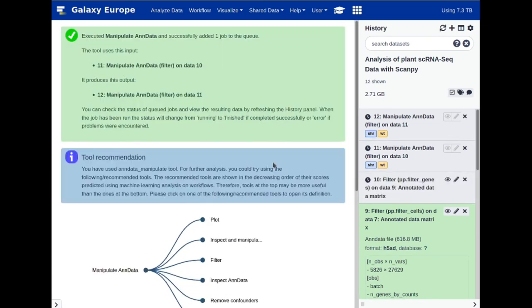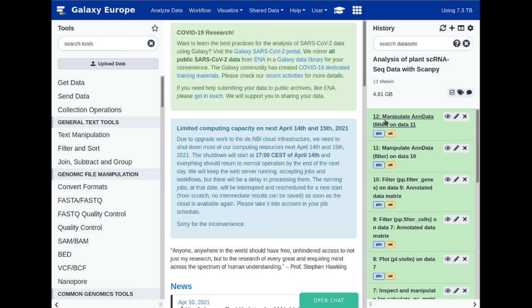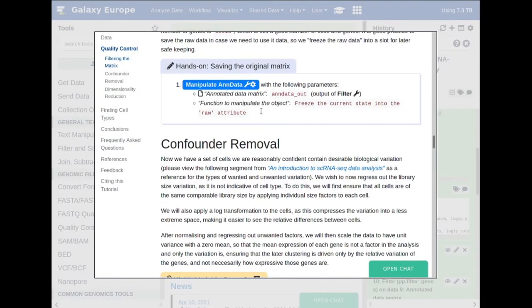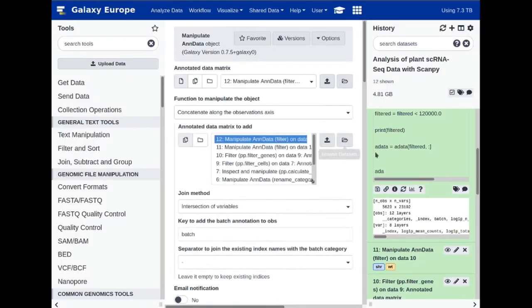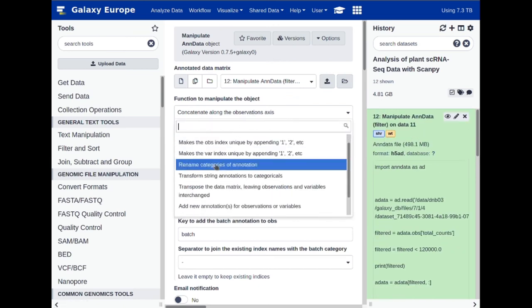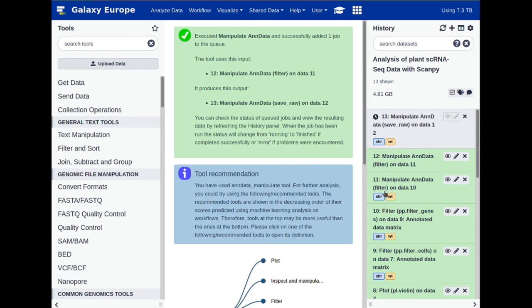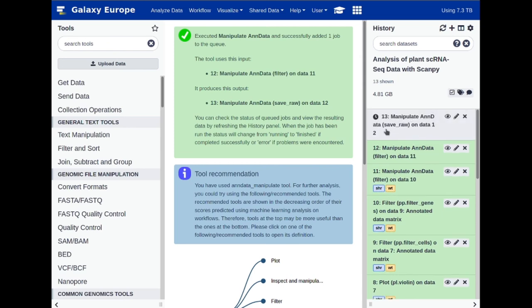Execute that. If we take a look at this dataset, we see we have 5,623 observations and 23,102 variables, which is exactly what we expect to see. What we now want to do is preserve the original matrix by freezing it into a raw slot. This will help later on — potentially not in this analysis but in a later analysis where you want to perform rank gene assignment and wish to use the original dataset. Click on 'Freeze the current state into the raw attribute' and execute. Any further changes can then be undone by restoring from this raw slot.